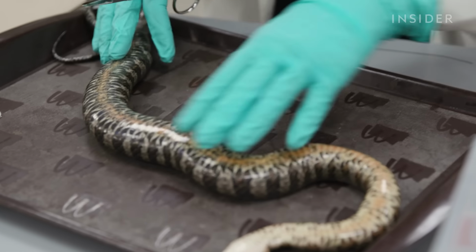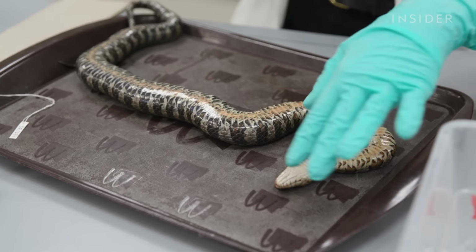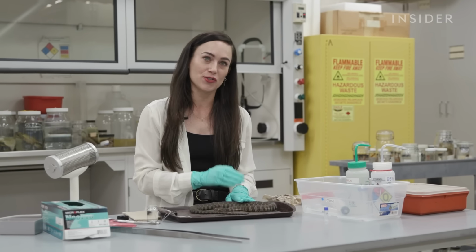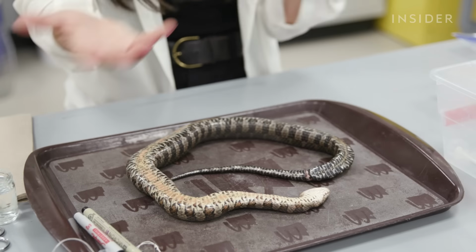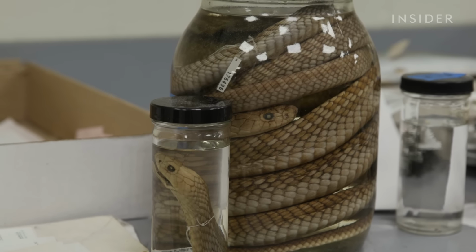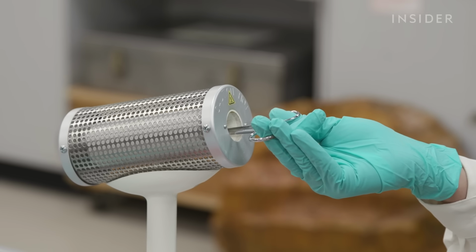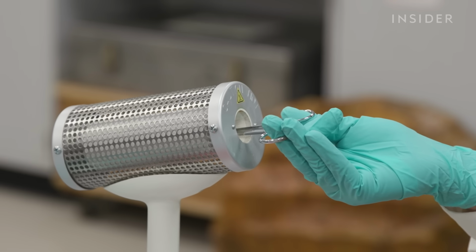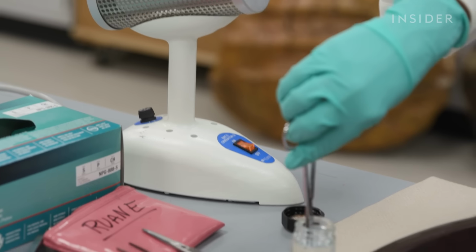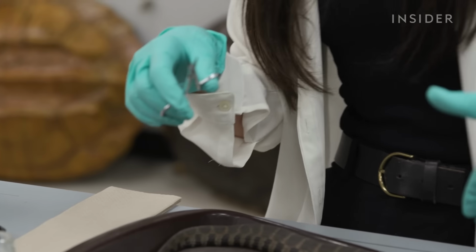This is a fairly new step in the process, since DNA wasn't really used the way it is now until the 90s. It's not impossible, but it is much easier to take tissue samples from fresh animals than it is to take them from preserved animals and get really good results. She uses scissors and forceps to collect the DNA sample, first sanitizing them by burning away any random DNA so the results aren't mixed. It does get so hot though, I have to dip it into some ethanol so that it doesn't essentially sear the animal as I work on it.